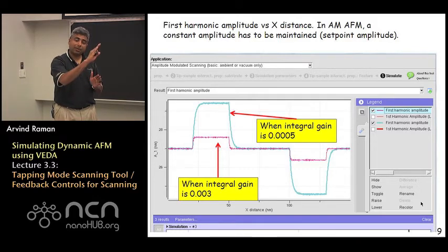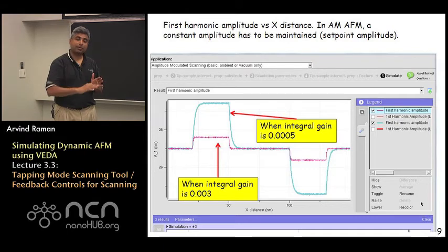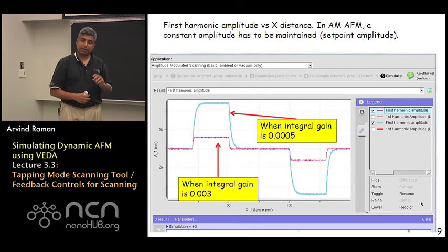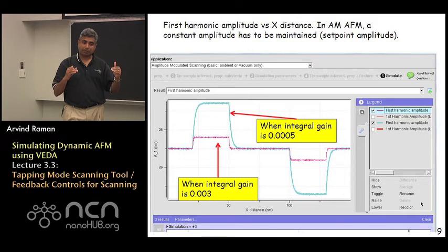And you can see that as you increase the integral gain, these error signals are starting to come down. So this is a very instructive example of why when one uses different gains, what influence they have.